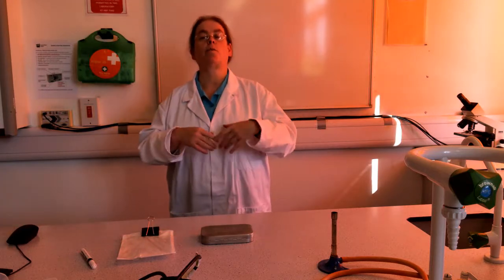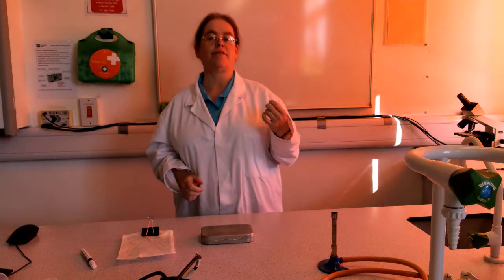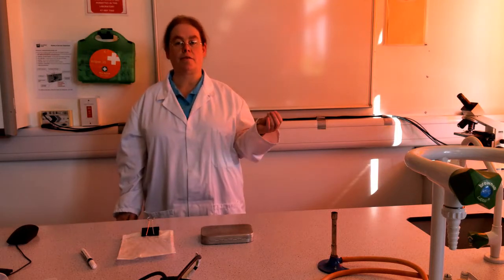Now, the third way is to test what we call a viable cell count. And I've demonstrated that, I hope, on another video, so I won't come back to that. That is in the video on finding the best growth media.